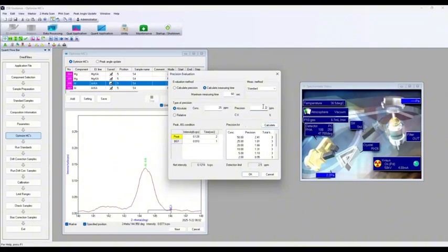And if I went and said, well, let me get a precision of 1 ppm, if I calculate, given that concentration, I would have to run for at least 7 seconds for peak, 2 seconds for background in order to achieve that precision. And that would be my detection limit for that. So it's a really nice tool as you're going through to determine what detection limits I should expect for an application. And I can do that all up front before I've generated calibration curves.